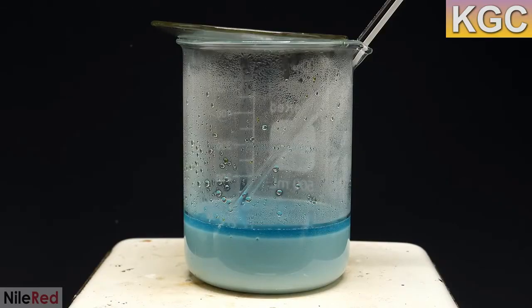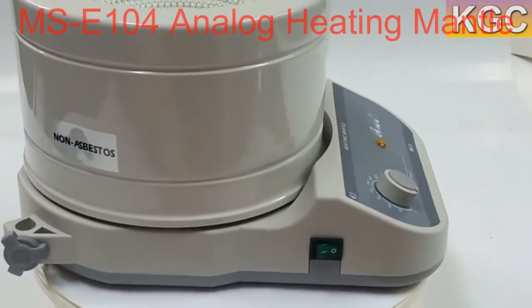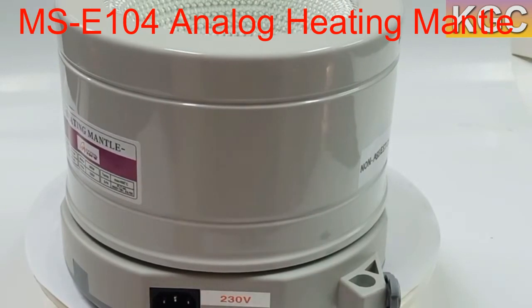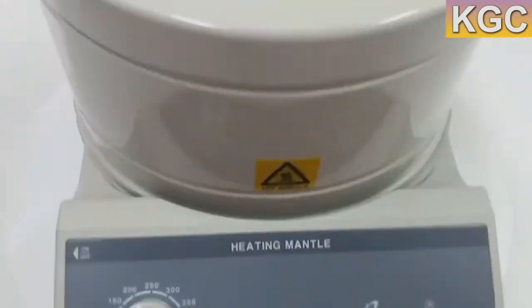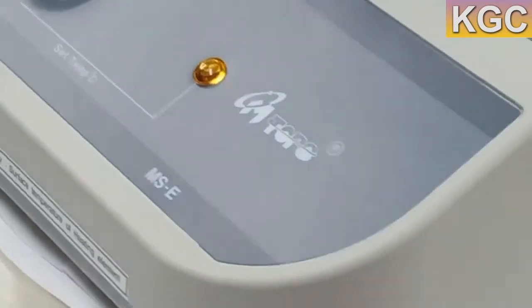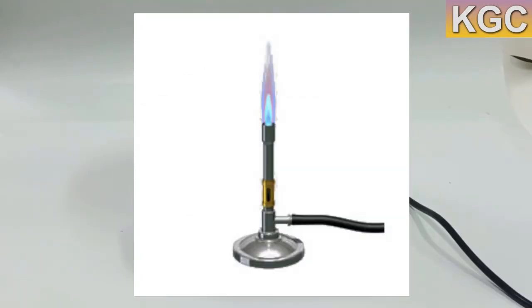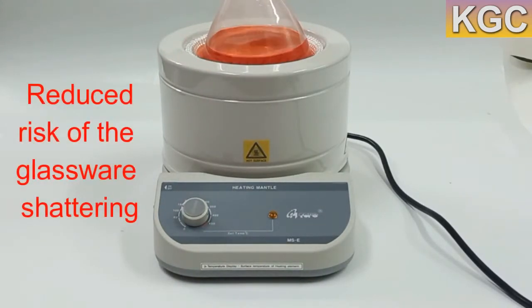How can you heat up beakers without increasing the risk of the glassware shattering? The answer is by using the heating mantle with regulator control MSC 104. This heating mantle, or isomantle, is a piece of laboratory equipment used to apply heat to glass vessels as an alternative to other forms of heated bath. In contrast to other heating devices such as hot plates or Bunsen burners, glassware containers may be placed in direct contact with the heating mantle.